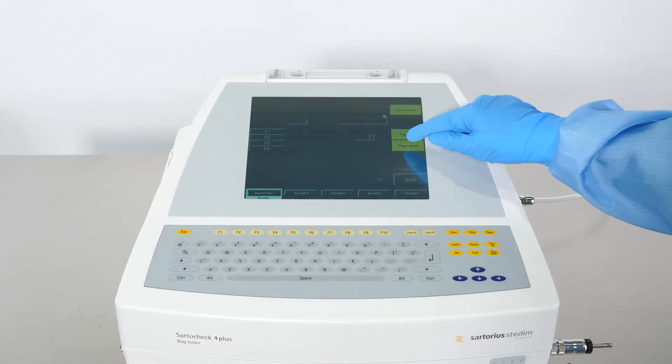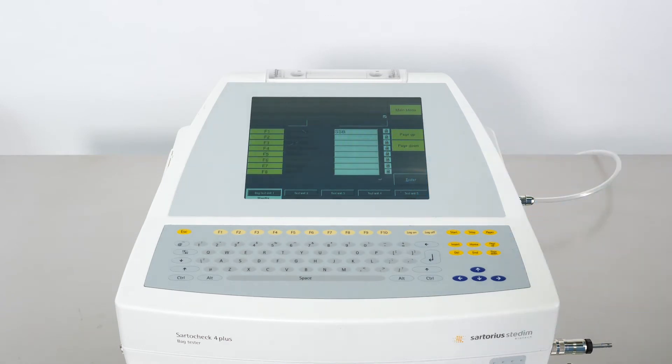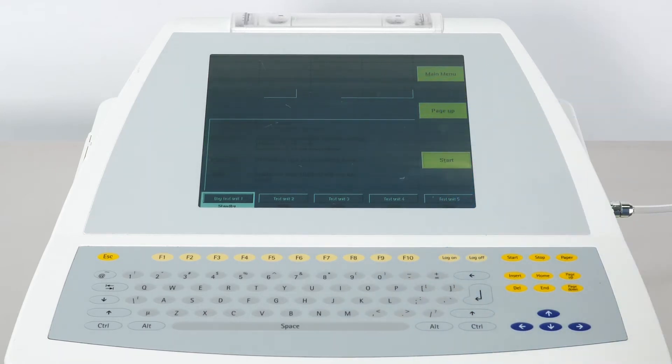Press the Page Down button until the screen displays Data Log Group Bag. Fill in your batch information. Then press Page Down until the screen displays the Start Menu.